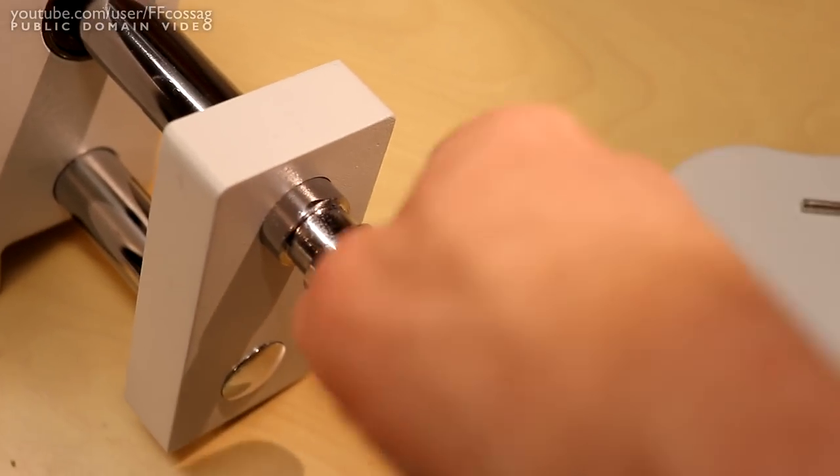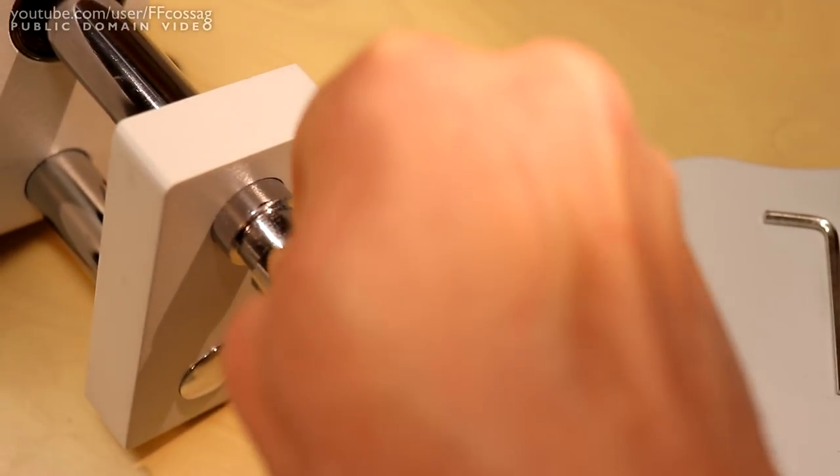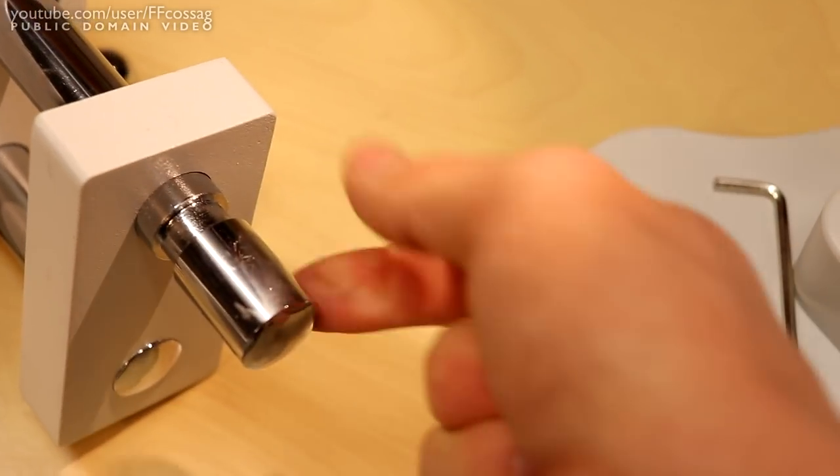I'm not sure if I can do this one handed. Yeah, I can dig into that and make more marks, making that completely ugly.